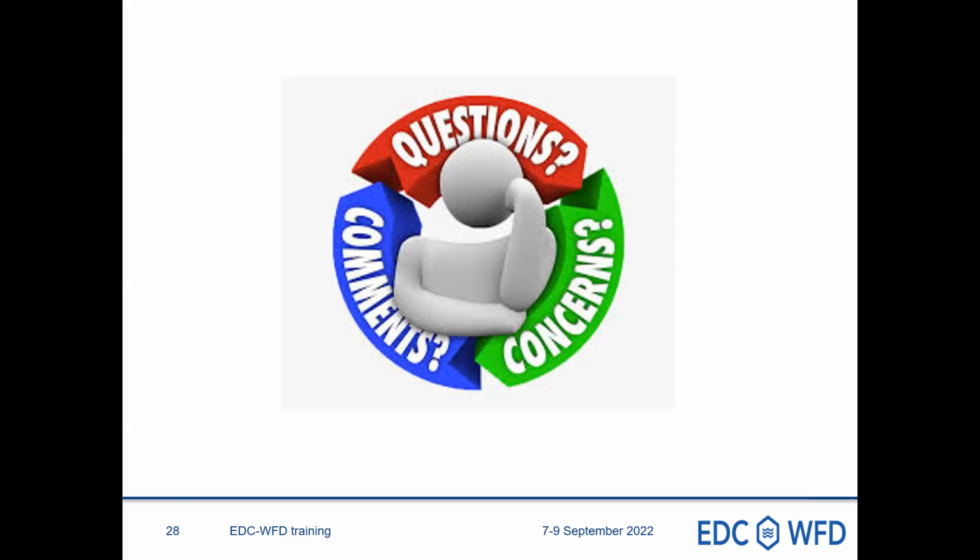Okay, so we will go on, but really for those of you who want to make this validation in real matrices, be prepared to be faced with such kind of issue if you tackle the lowest concentration, of course.